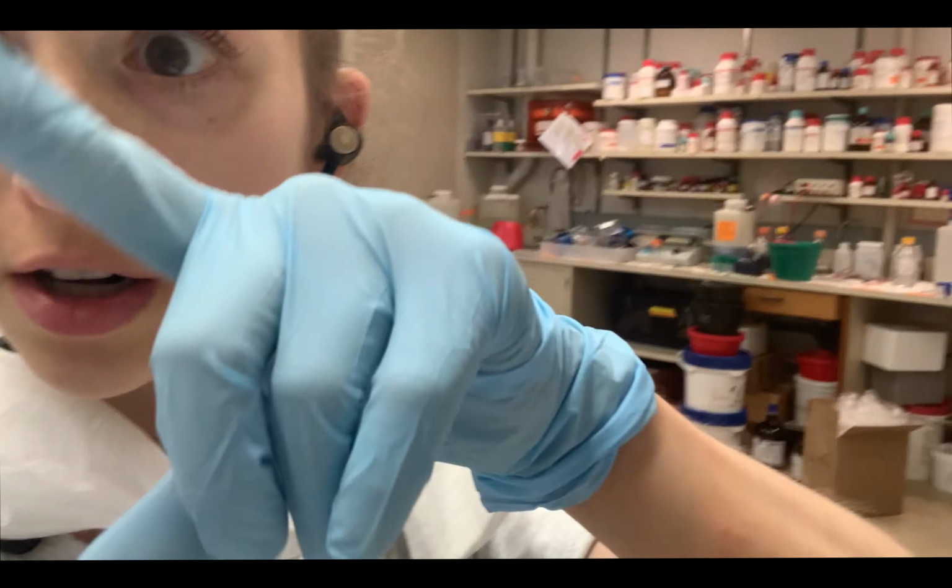Then you stick them in these little vials, which are filled with scintillant, which is a liquid. There are different kinds; this is the one I use. I put 2 mils of it in each vial, and I do that ahead of time as well. It's usually viscous and greasy, so I use a 10 mil pipette, suck it up, then do 2 mils per vial. Efficiency. I prepare those ahead of time and take all of it in my little Santa sack that I use to carry everything down across campus.